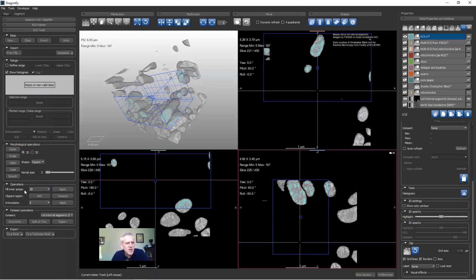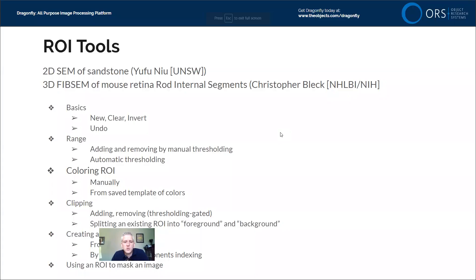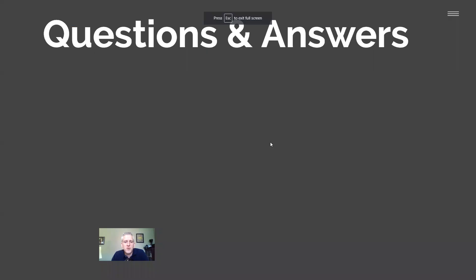I'll save the Fill Inner Areas and Interpolate features for lesson nine on ROI Painter, where they'll be more useful to cover. I think that's enough for today — we did see most of the ROI tools, particularly thresholding and basic tools, and saw how to create multi-ROIs and convert between ROIs and multi-ROIs. With that, I'll switch over and take questions from today's lesson.